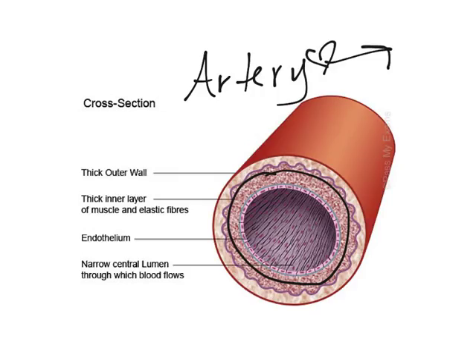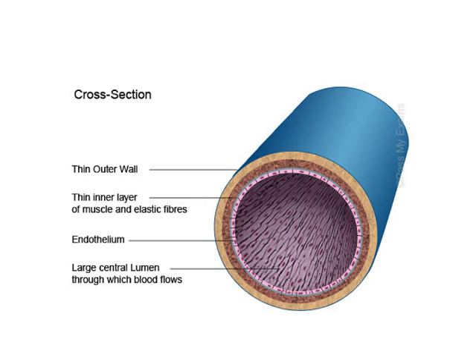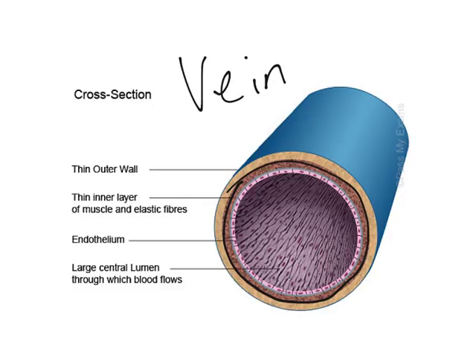So the difference, now we're going to look at a vein, and you'll see the difference. This is a cross-section of a vein, so it's got a much smaller layer of that muscle and elastic fiber. And I'll show you a histology slide of the two compared next to each other. Veins are almost kind of floppy. They lack the shape that arteries do. Arteries are much stronger, and they have this not perfectly round shape, but it's got a lot more structure than does a vein.